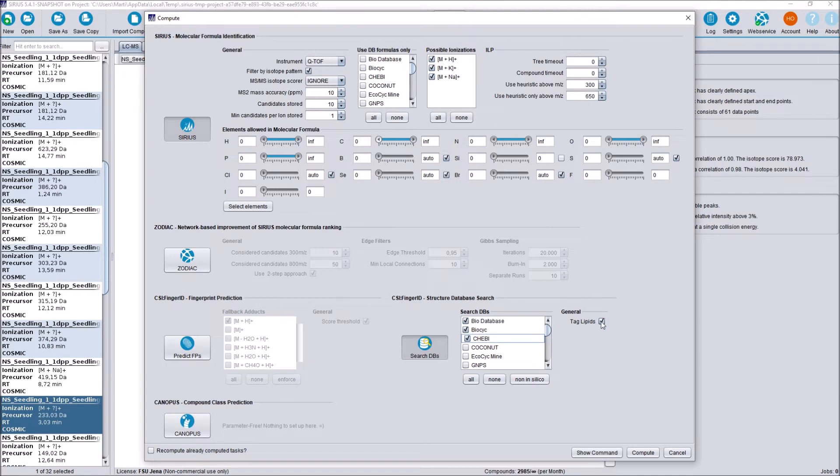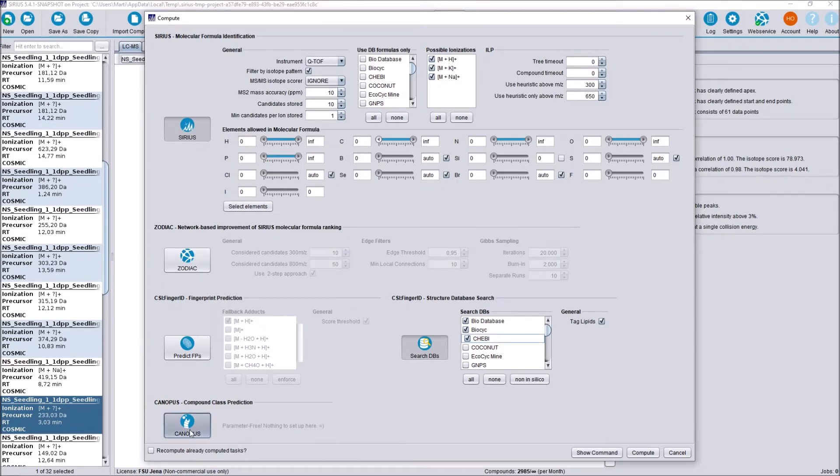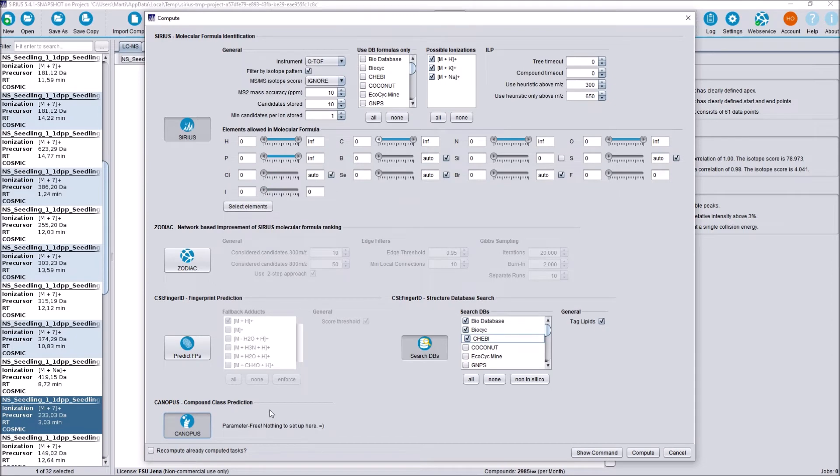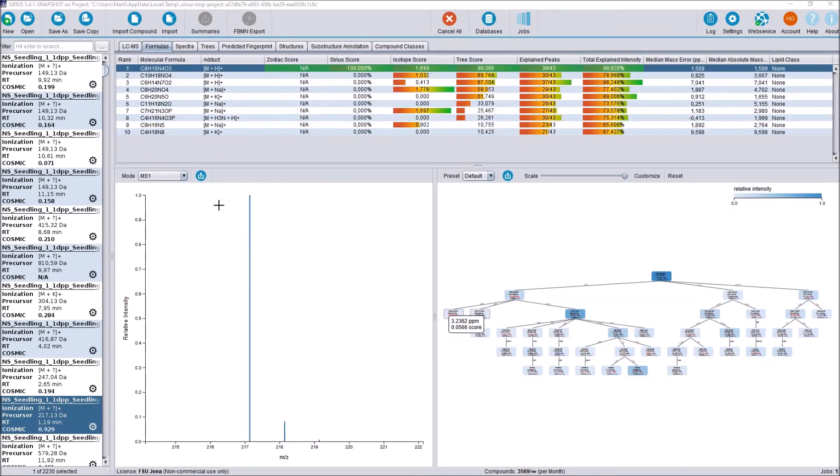We also have the tagged lipids here, which is a checkbox I will go over in more detail once we go to the lipid annotation part. Then we also enable CANOPUS. As usual, there are also no changes here.